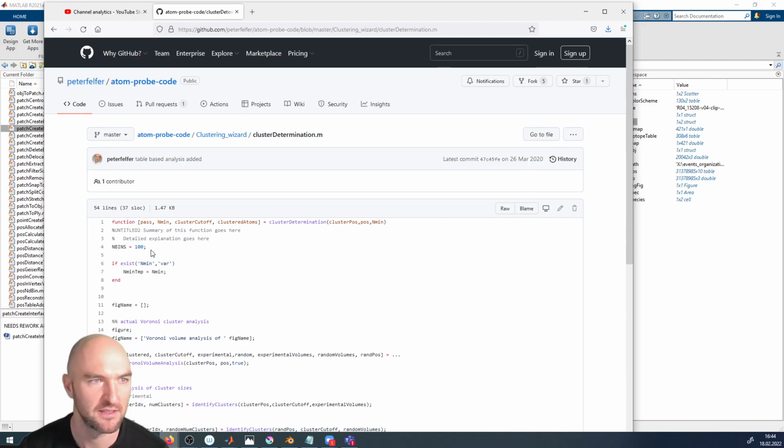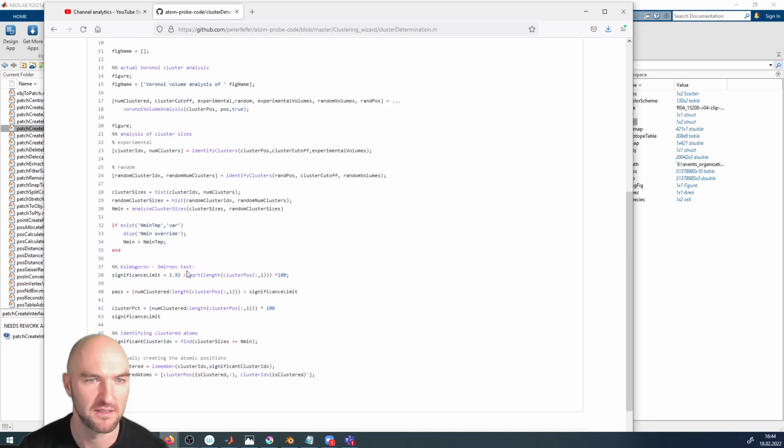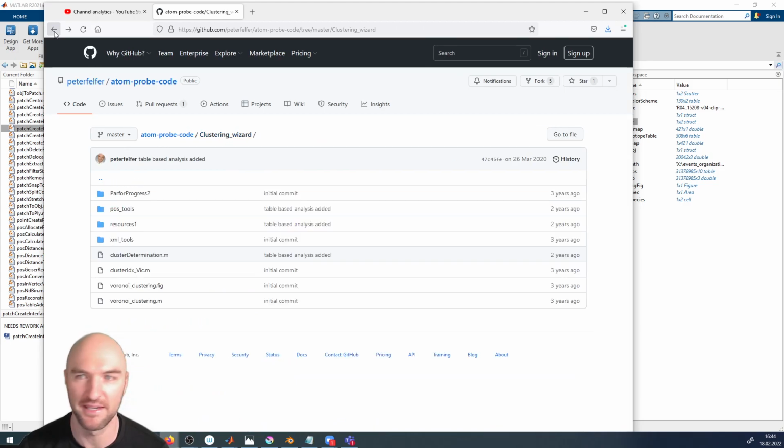Peter, I think it's already in the toolbox because I already used it and I changed the code. Okay, then it's in the toolbox already. So we have a self-consistent approach to clustering. Clustering is kind of like histograms. There is no one way to do it, unfortunately, no optimal way to do it. But I've programmed one ages ago that is self-consistent at least, so you don't have to do anything. You can just press go, and it does its thing.